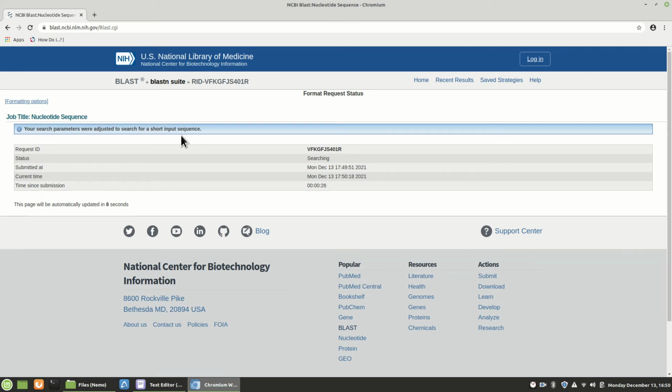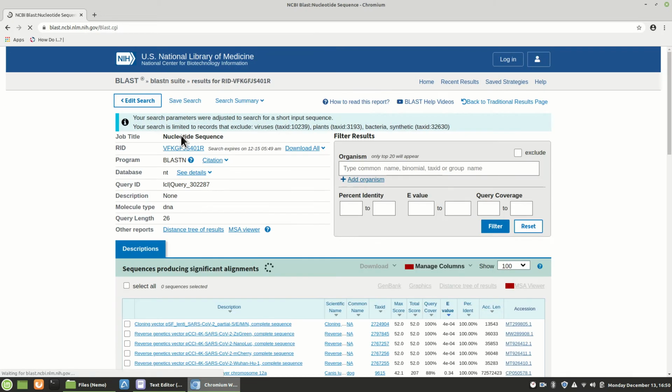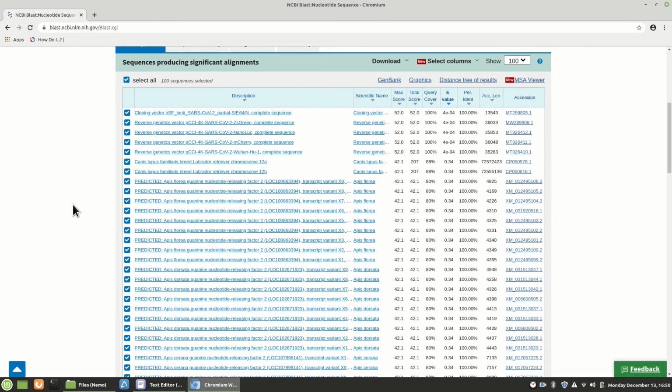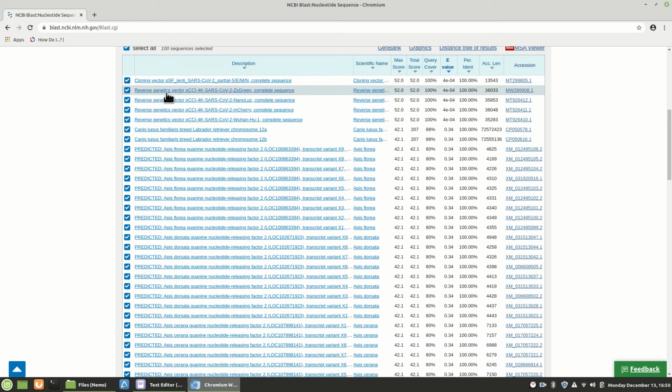I tried it all around the genome and rarely got results. So if you use some shorter sequences, kind of all over, you don't have to use the entire sequence. Just grab some small 20 to 30 base pairs at different parts and then run it like I did, and you should get something.